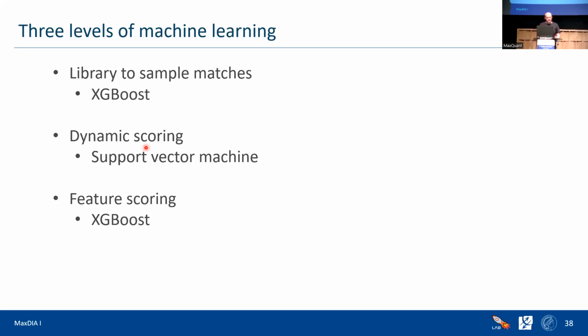DIA, in terms of sensitivity, should be even better. But already now, we are really surprised how good it is actually. And just to show you some recent benchmarks.